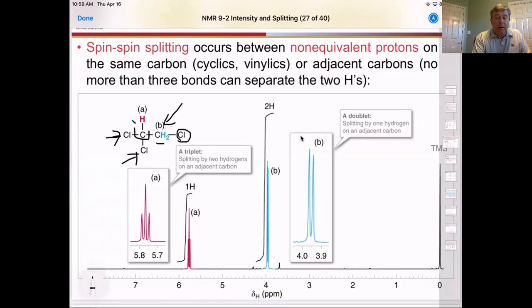So we have 1 hydrogen here and we have 2 hydrogens here, okay? So in general, what that means is these 2 hydrogens have a signal by themselves and it's going to be split by the non-equivalent hydrogen next to it, giving us this peak here. And this hydrogen is non-equivalent and therefore is split by these 2 protons to give us a total of 3 peaks here. Let's dive into that a little bit deeper, okay?